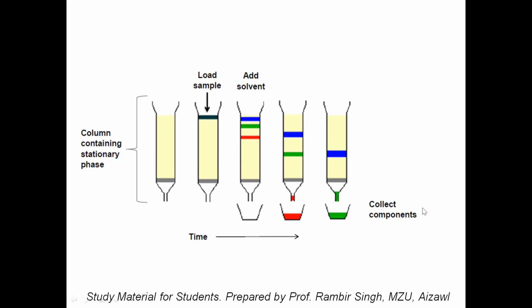Okay, now comes the major point. Suppose I am having a reverse phase column, where the stationary phase is silica. No, in a reverse phase column, the stationary phase is derivatized silica, C18. We call it an ODS column. C18 means it is a non-polar column.